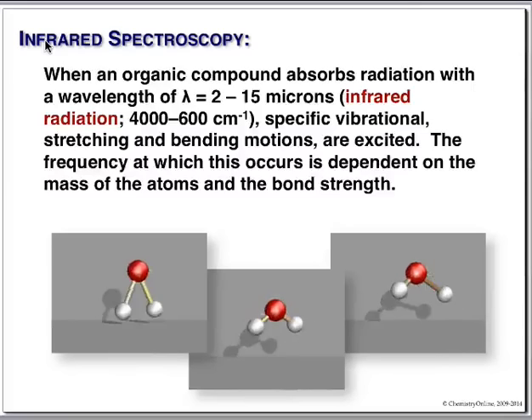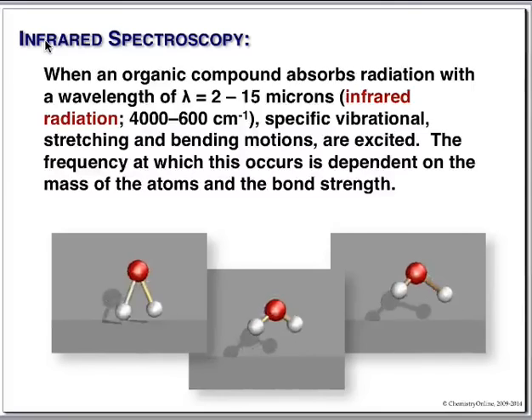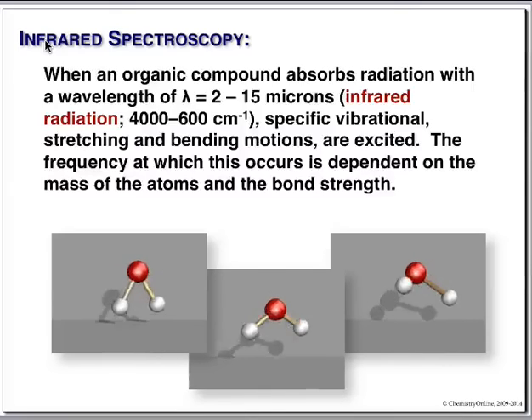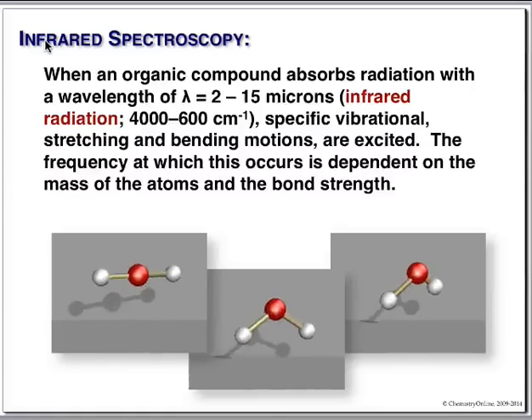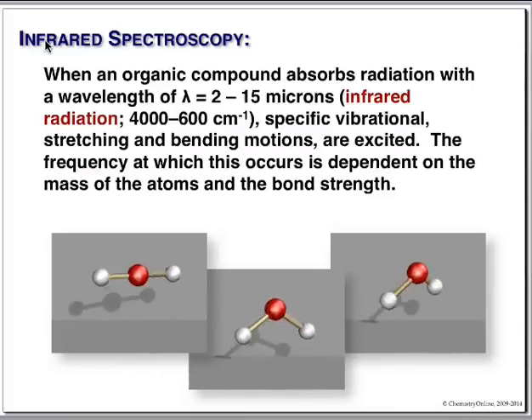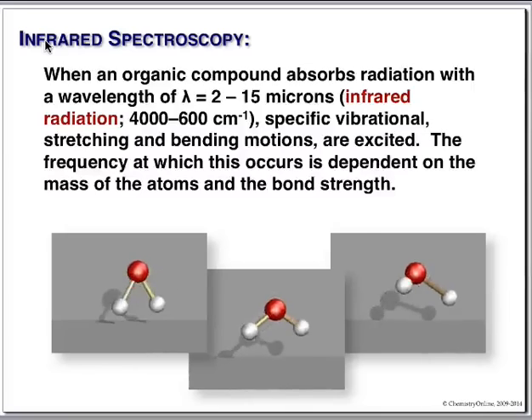Now, what happens in IR is that a molecule will absorb a quantum of energy when it's exactly the right wavelength, exactly the right energy. It will excite a movement in the molecule. Typically, we're going to be dealing with stretches. IR also excites bending and wagging and wiggling and breathing and all of that stuff. That's much more complicated. This is actually water, but this is a bending vibration here, calisthenics. Again, these are stretchings. This is symmetric and asymmetric. We'll talk about those. These all occur at different wavelengths because it takes a unique energy to excite them.